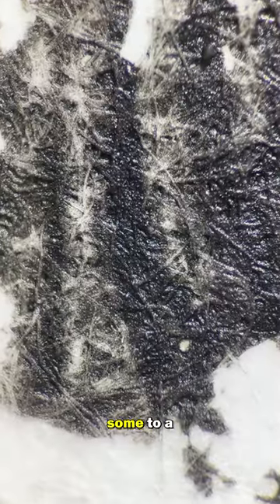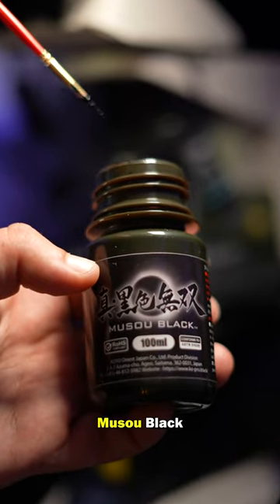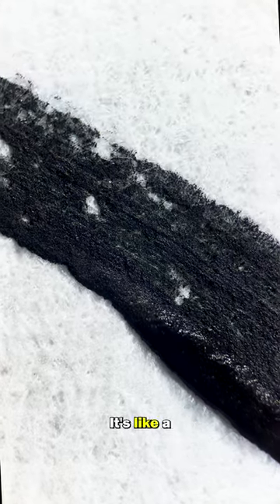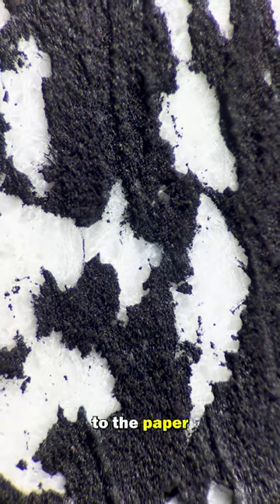This is a regular acrylic black paint. I applied some to a piece of paper and it does what I expect — it's okay. But now for Musou Black, straight up the paint is very thick, it's like a paste or a cement. When applied, it gives a raised texture to the paper.